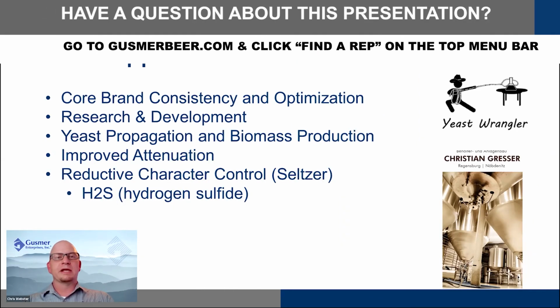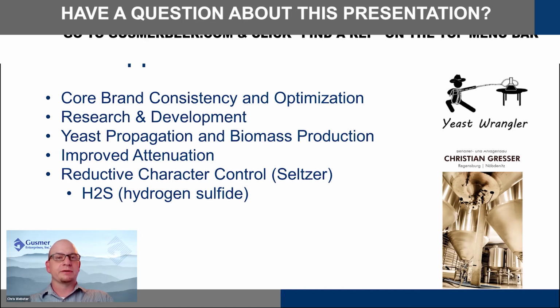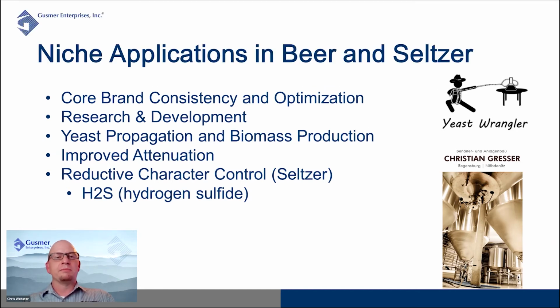As we move forward with our understanding of ORP, we get into some of the application points where you as a brewer or seltzer manufacturer can really gain some insight. ORP can be used in many of these niche applications, whether in beer or seltzer. Some of the big areas to focus on are core brand and consistency. Your flagship brands are your bread and butter. They need to be produced consistently, day 1 through day 365 of the year. Any sway from consistency is going to lead to potential brand disloyalty in the marketplace. Using ORP gives you a real-time in-the-tank measure to see what's happening. How are your yeast behaving? How is the chemistry moving around in flux in this fermenter?